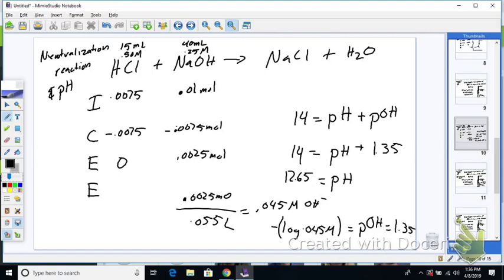Calibrate! We need to calibrate so you guys can get some trials in. Hey Chloe, you don't need to... We have extra days. We still have 100 milliliters. This thing only holds 50. Okay, we have 100. That's good. So, calibrate.